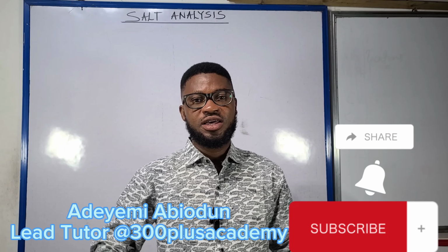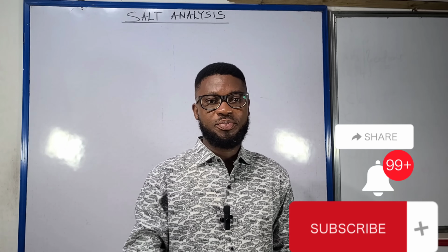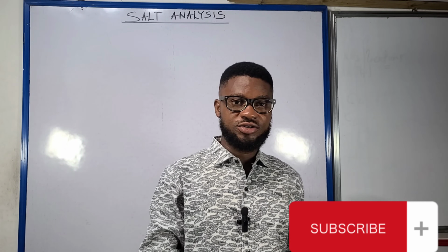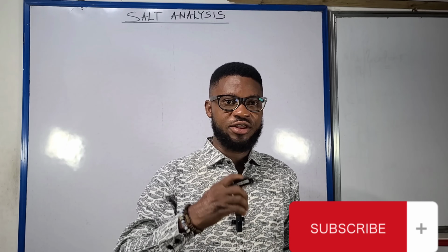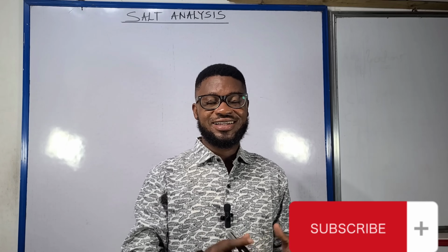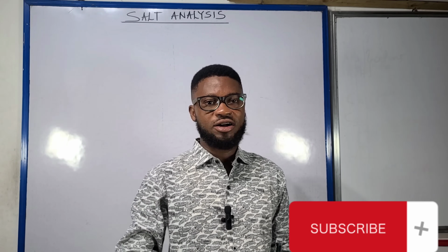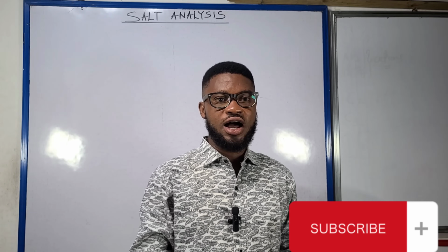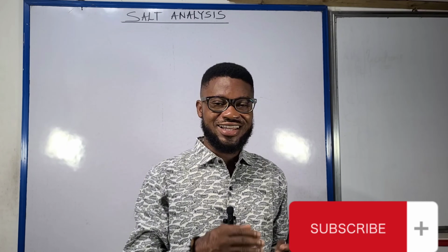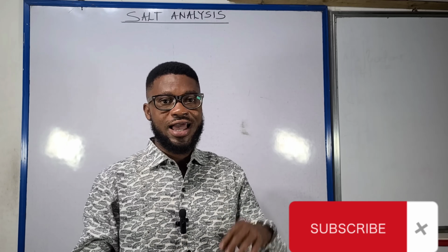Still on the business of chemistry 2024 practical for WAEC examination. I haven't looked at volumetric or titrimetric analysis, and of course, looked at probable questions. It's about time we look at what we call qualitative analysis, talking about identifying ions, anions, cations, gases in a given sample in the course of this exam, more popularly known as salt analysis.